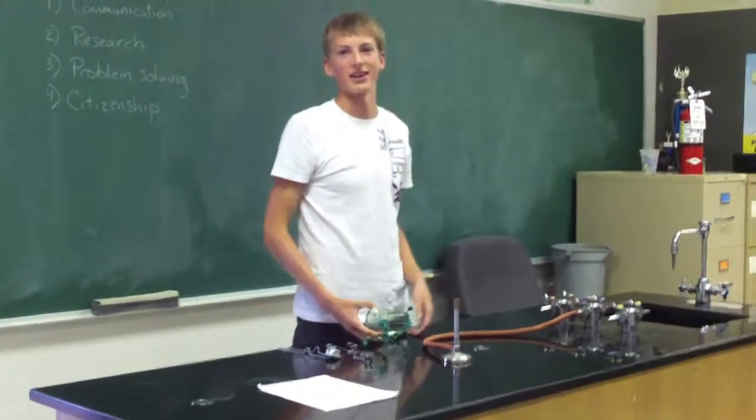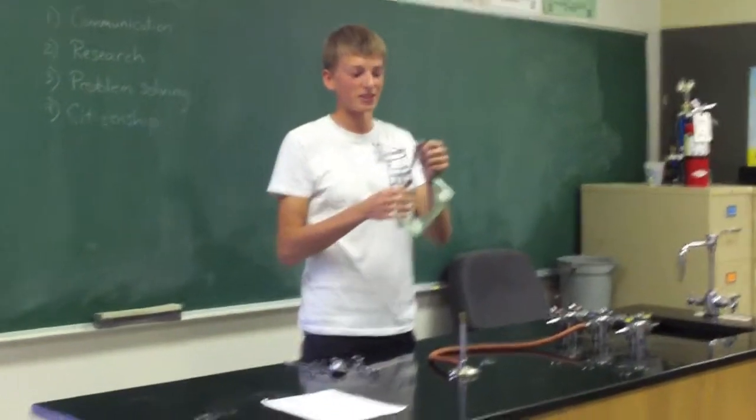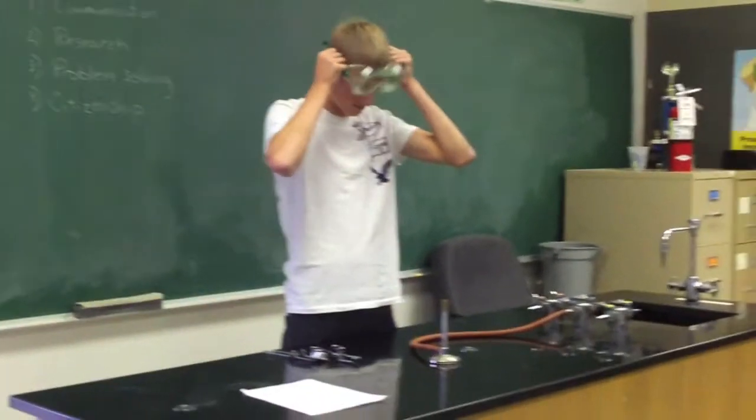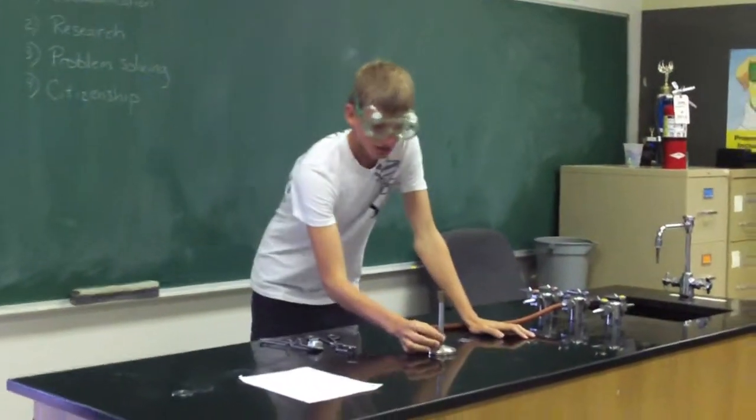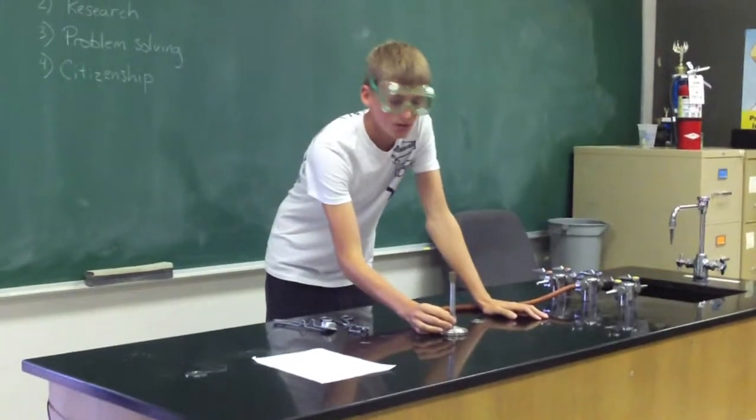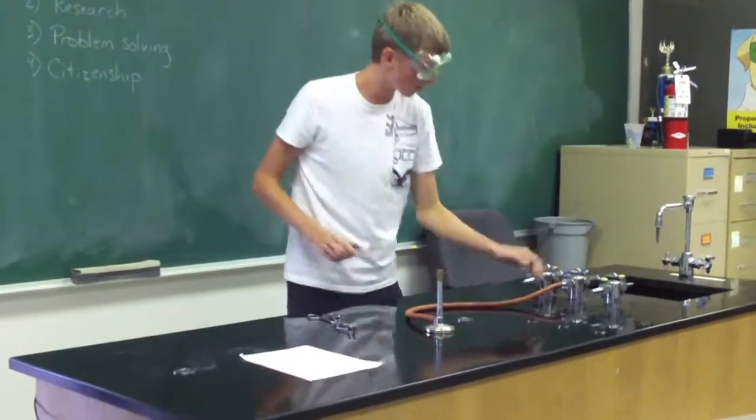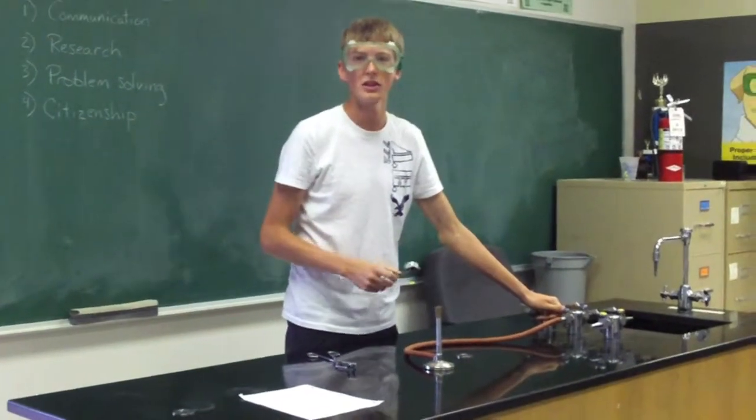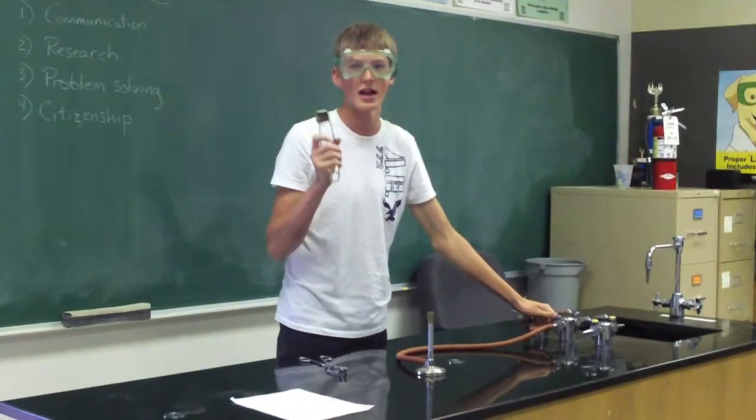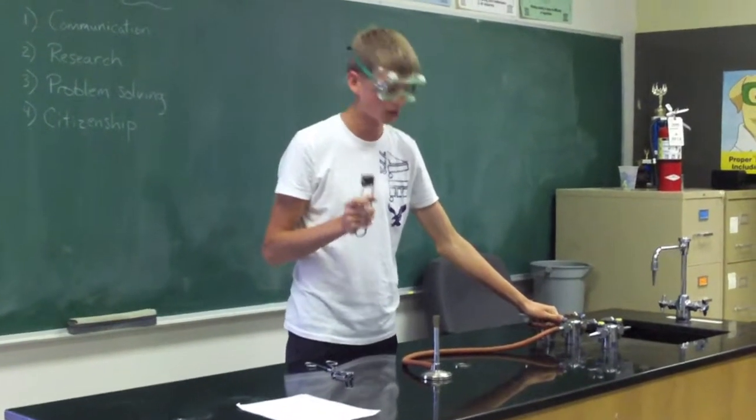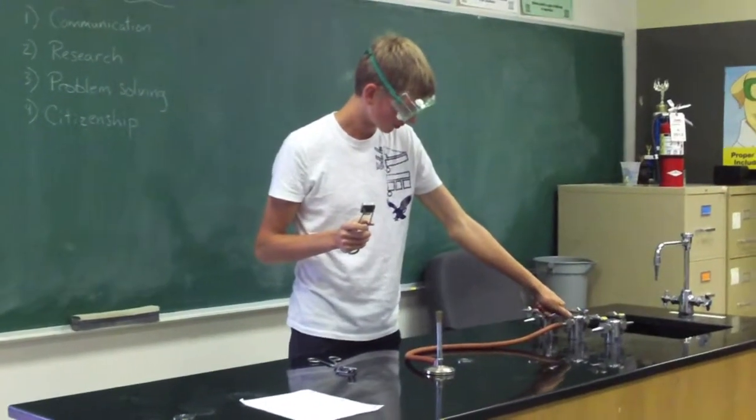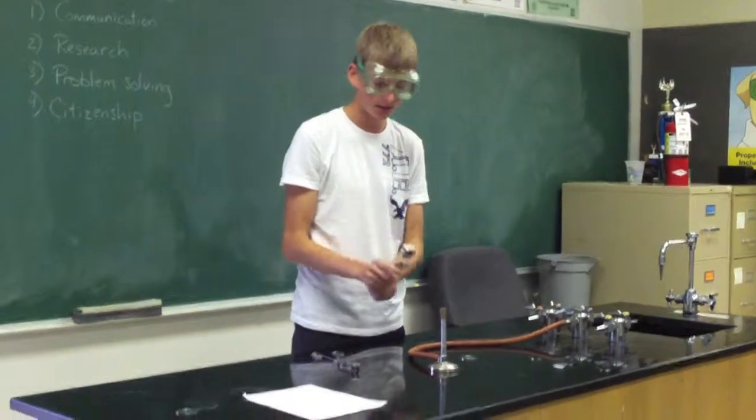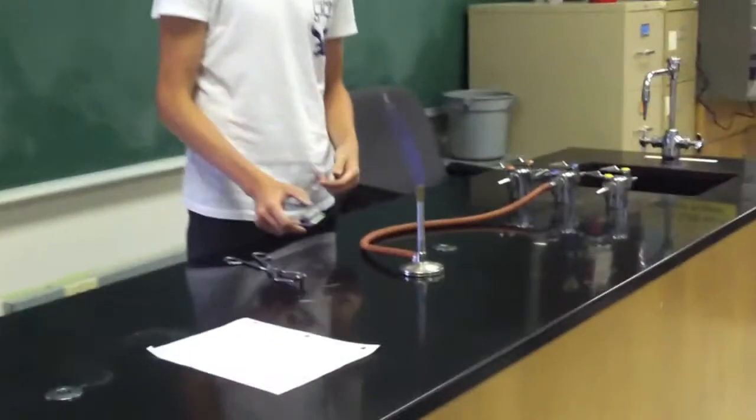Lighting the Bunsen burner. We're going to put our goggles on for safety. We're going to make sure that the air valves are closed, and then we're going to turn on the gas. You want to turn on the gas until you can hear it hissing out of the Bunsen burner, and that's when you know to start igniting it. I can hear it, my hand's to the side, and I've ignited the Bunsen burner.